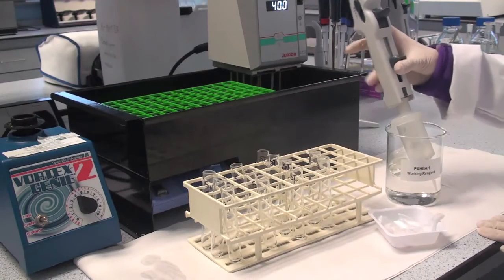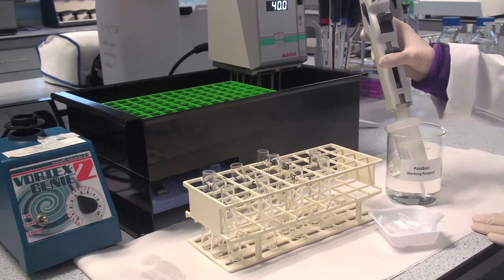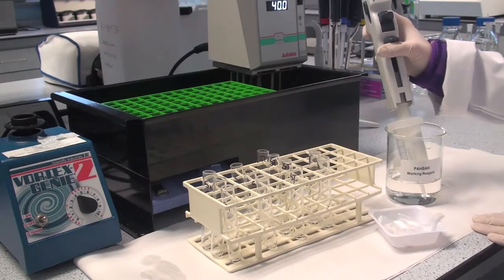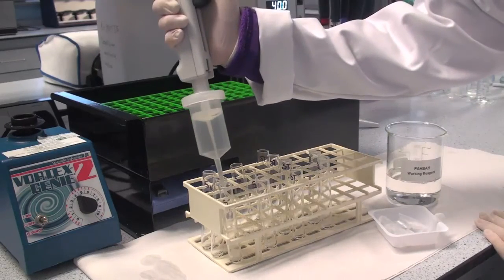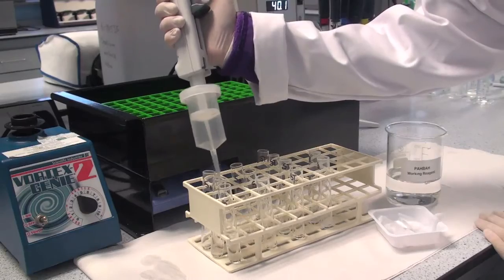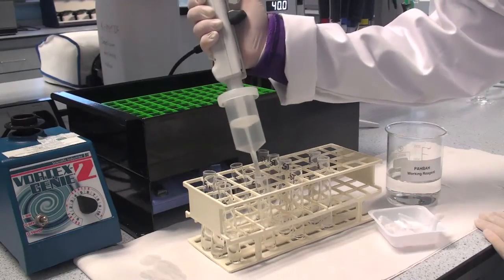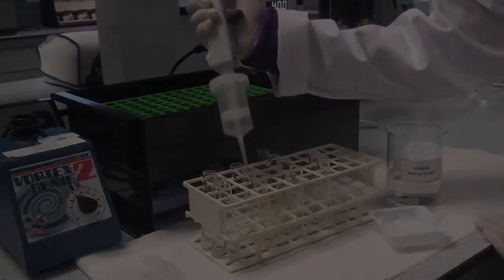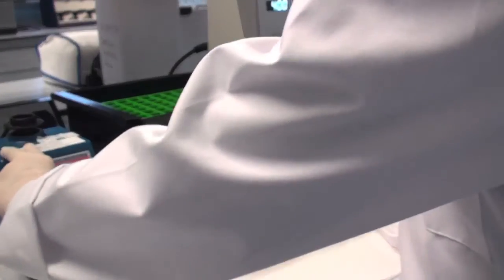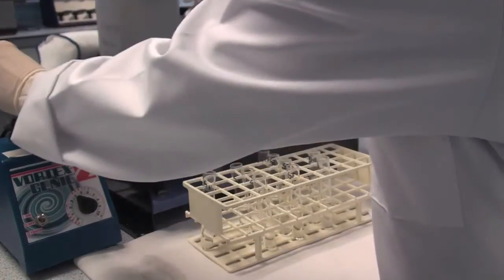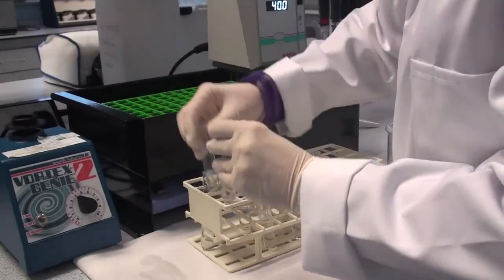Add 5 mls of PAHBAH working reagent to all tubes: the samples, the sample blanks, the fructose standard reagent blank, and the fructose cellulose control sample if included. Mix the tube contents thoroughly on a vortex mixer.